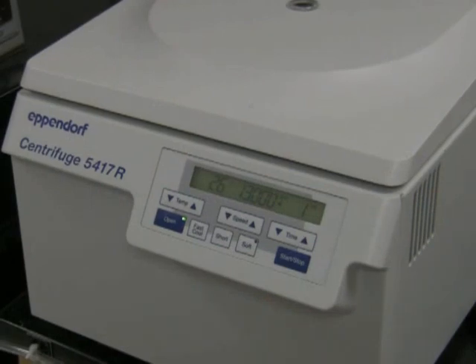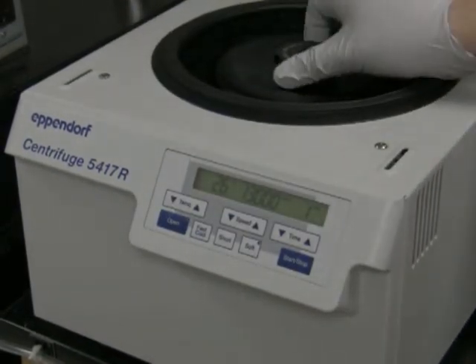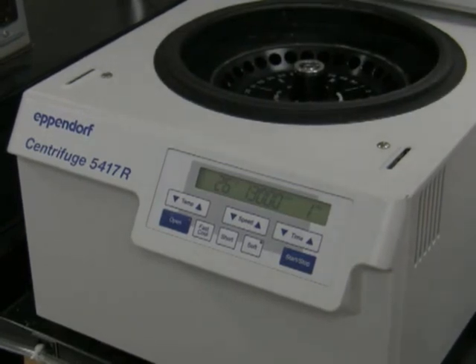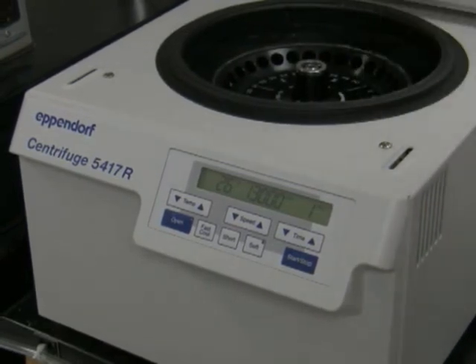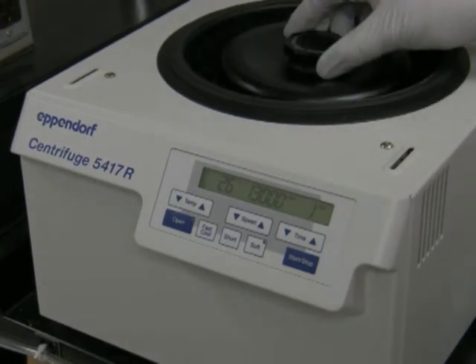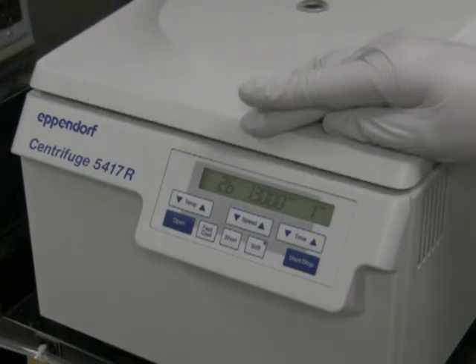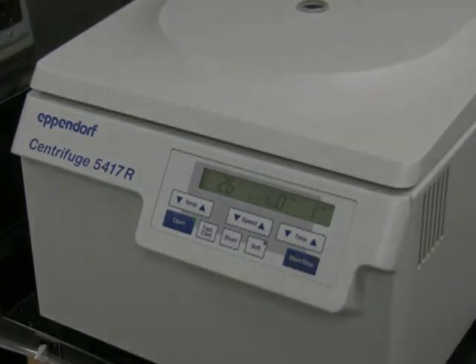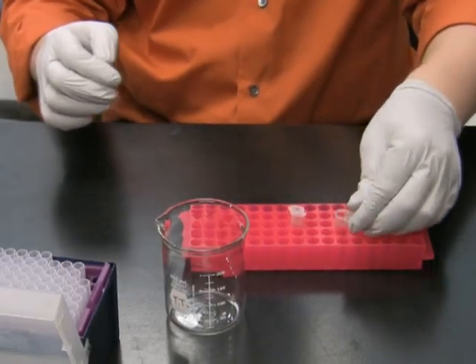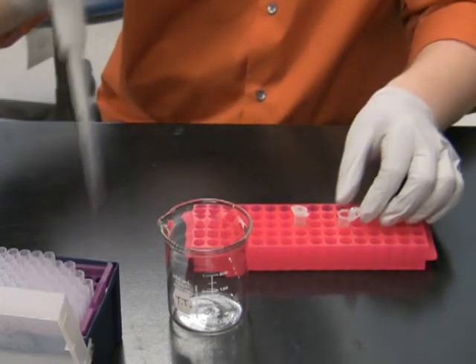Before plating, I'm going to reduce the volume back to 200 microliters by spinning down the tubes in the microcentrifuge for one minute. Then I remove 800 microliters of supernatant and resuspend the cells in the remaining 200 microliters of LB.